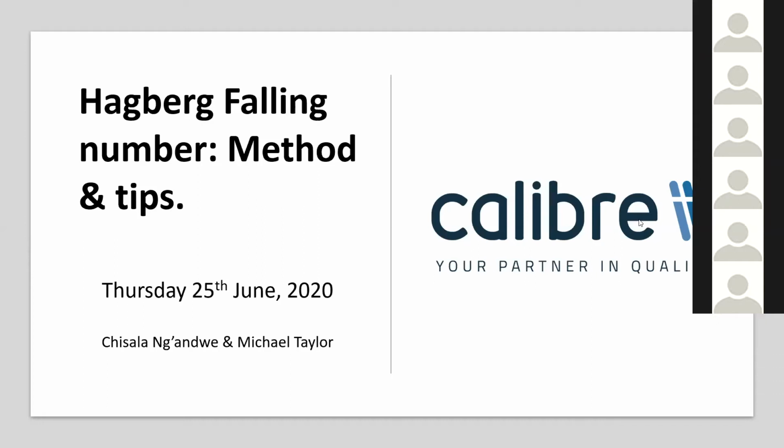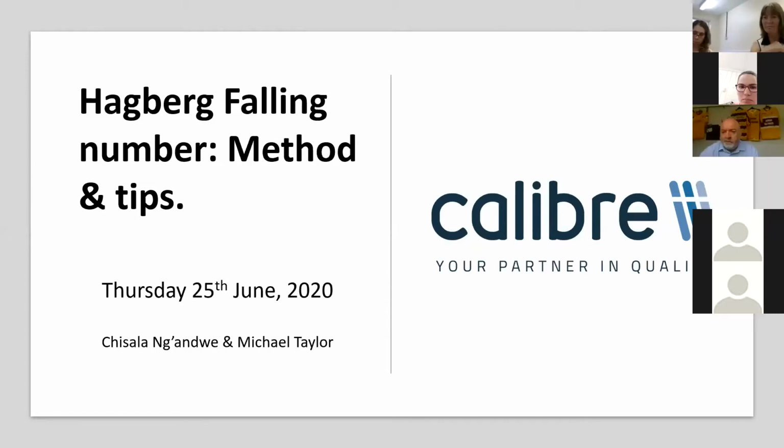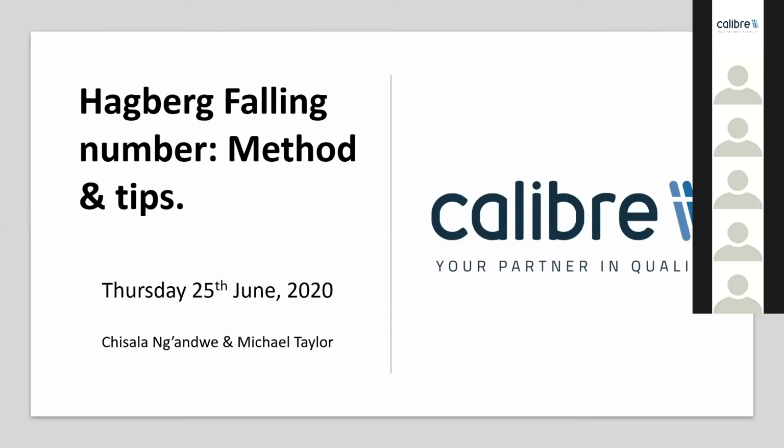Good morning, everybody, and welcome to our second in the series of our webinars. Today's topic will be the Hagberg Falling Number method, where we will be looking at the principles behind the test, as well as going through a live demonstration of the test.